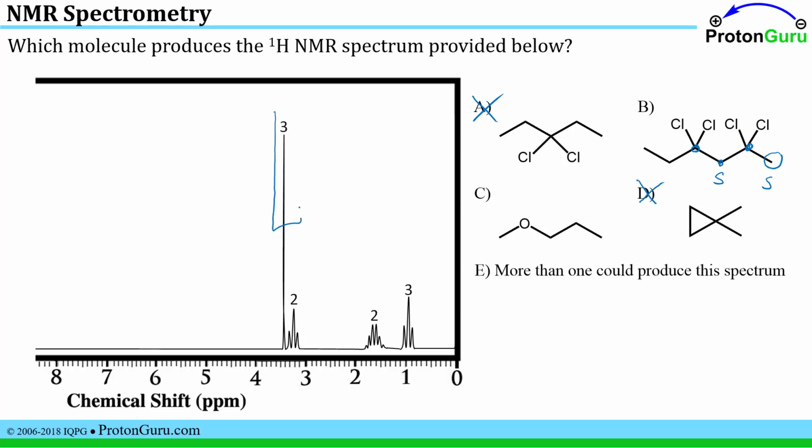Well, we only have one singlet. The other ones are triplets or more complicated multiplets. So we can rule out choice B, and hopefully choice C will match. This carbon with the 3 hydrogens is adjacent to an O, which has no hydrogens on it. So this will give us a singlet. All right, singlet integrating to 3 is consistent with a CH3 that should give us a singlet.